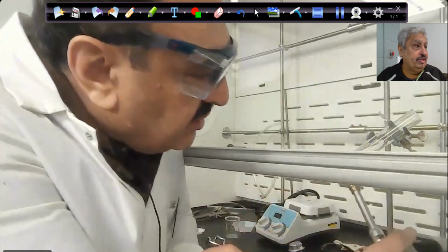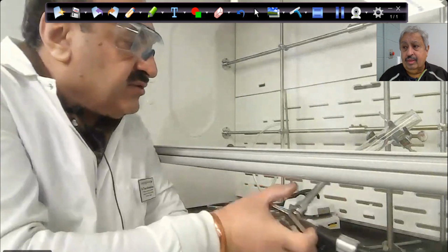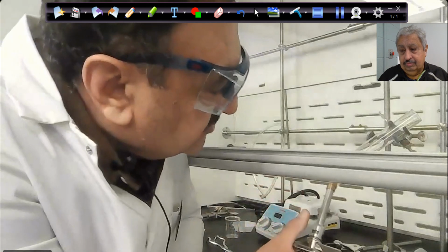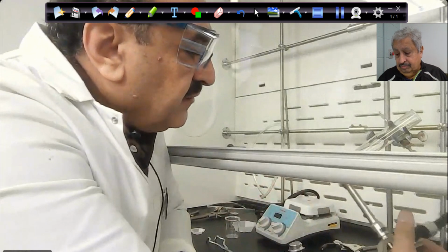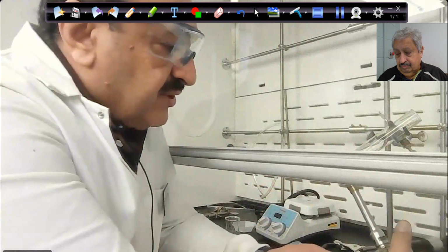It's just too risky. Make sure that we heat up our mixture in the proper way, and then I will shut off the flame and leave it to cool down, and I will stop the recording.